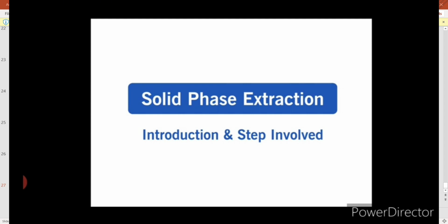In this video, I am going to discuss two things about the solid phase extraction technique, namely first, introduction to bonded phase, and second, steps involved in SPE. Now let us first understand the introduction to bonded phase, followed by the steps involved in SPE, that is solid phase extraction technique.